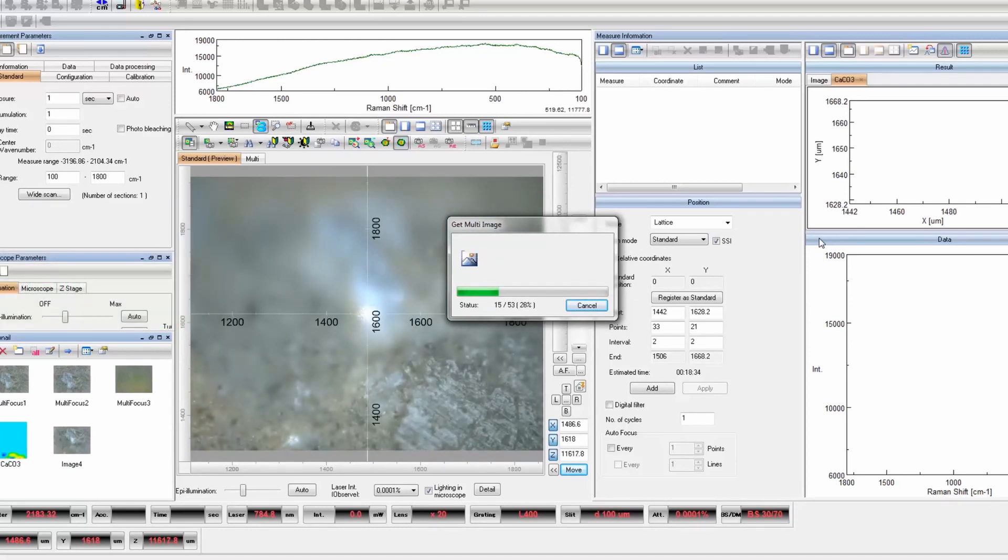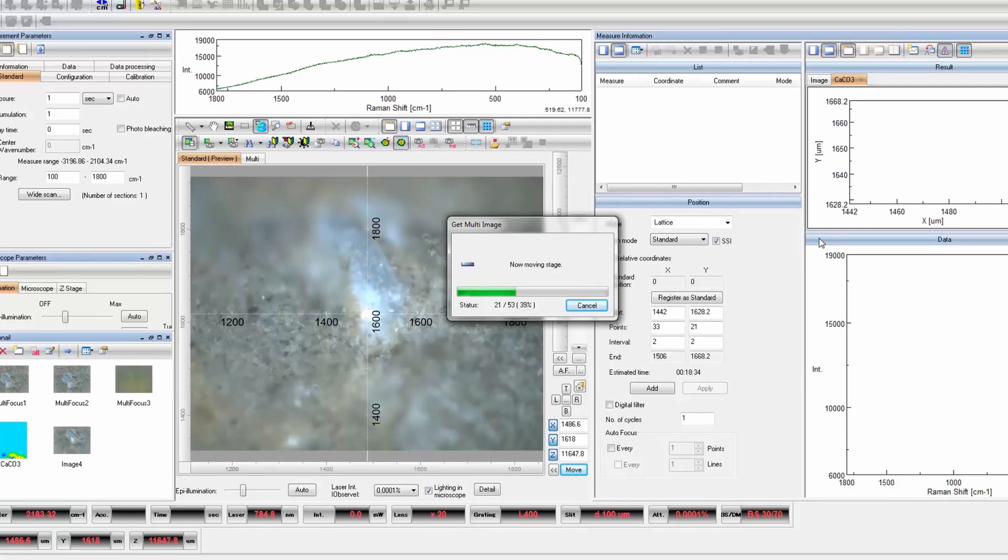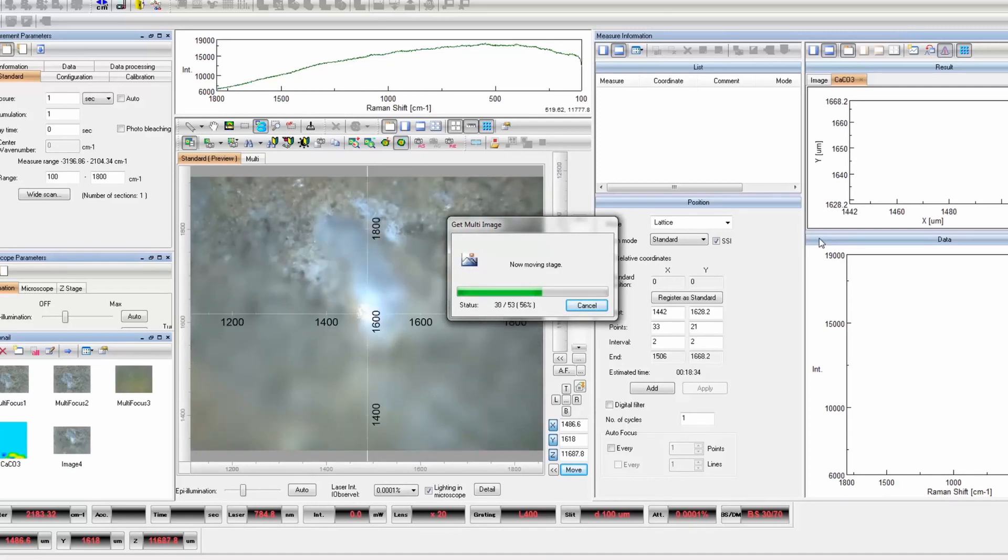Selecting simultaneous data analysis means that the image is built up in real time during the measurement.